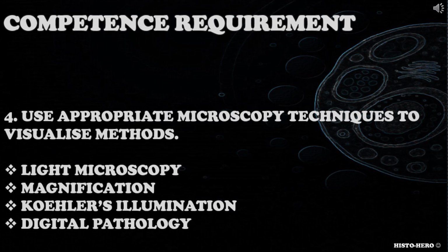The fourth competence requirement is for you to use appropriate microscopy techniques to visualize methods. What type of microscope do you use to view relevant demonstration methods? Consider light microscopy, magnification, Kohler's illumination, digital.